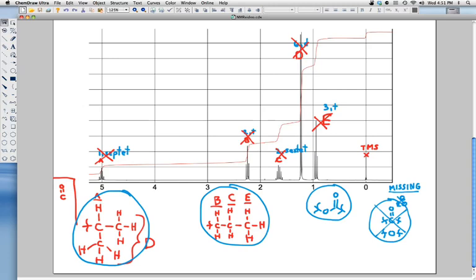Looking at the chemical shift of peak A, this has a value of 5. Okay, so that's pretty downfield. That's a high ppm number. If you look at the value of B, that comes at about 2.3. Okay, so what we know is that H on a C next to an O normally comes between 3 and 4, and we don't have anything there. This peak at 5 is further downfield. It's a higher ppm number. The carbonyl, so an H on a C next to a carbonyl, that normally comes between 2 and 3, and we do have a peak there. So what this clearly indicates is B is not going to be connected to our O, it's going to be connected to our carbonyl. So what we can do is draw our final structure.